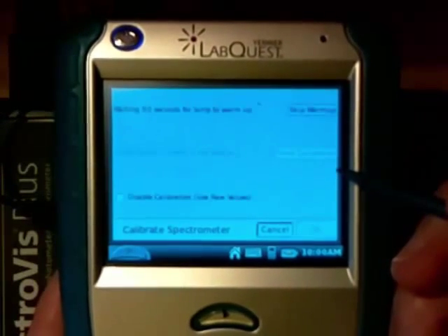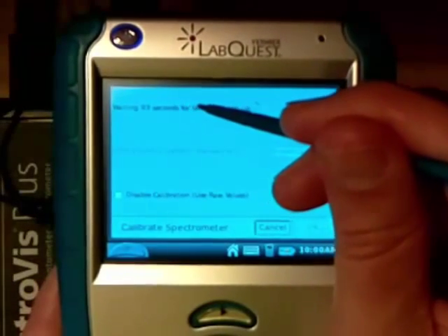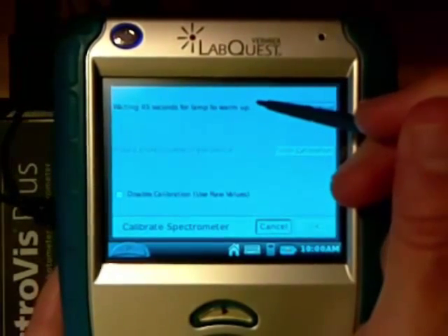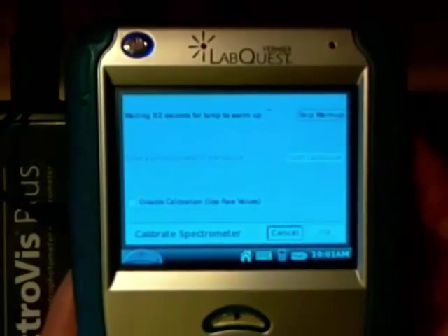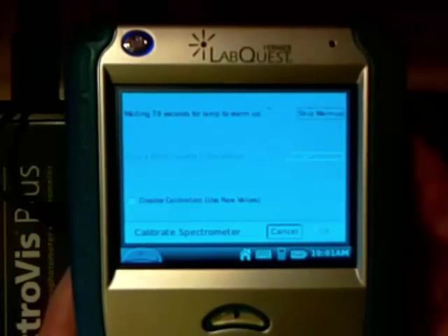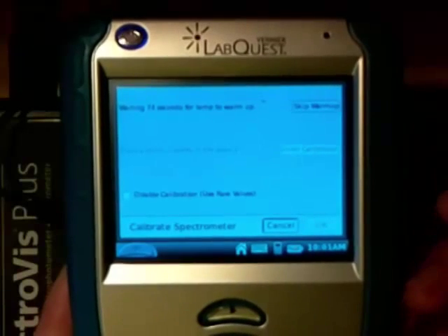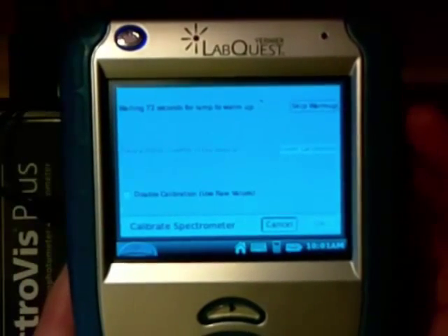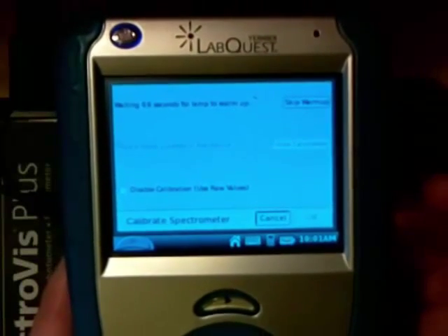It takes a little bit to load. At the top here it says 'waiting 87 seconds for the lamp to warm up.' We are going to let this lamp warm up — I can use a little bit of video magic to speed this up so you don't have to sit and wait watching this video, but you do need to do this if you're sitting in the lab.